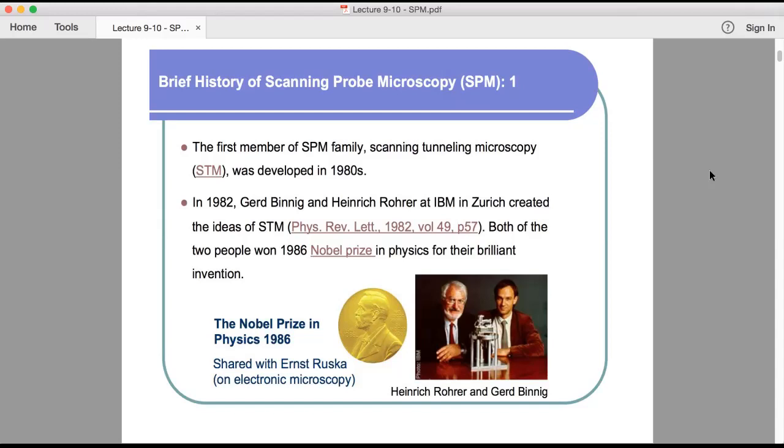The pioneering couple was Dr. Gerd Binnig and Dr. Heinrich Rohrer, who invented the first scanning tunneling microscope in 1981. This was a significant breakthrough in the field of nanotechnology because it allowed scientists to view a representation of the surface of samples at an atomic level. It is now possible for scientists to view individual atoms, study their properties and manipulate them to create new structures using these scanning probe microscopies. They received the Nobel Prize in Physics in 1986 for the invention of the scanning tunneling microscope.